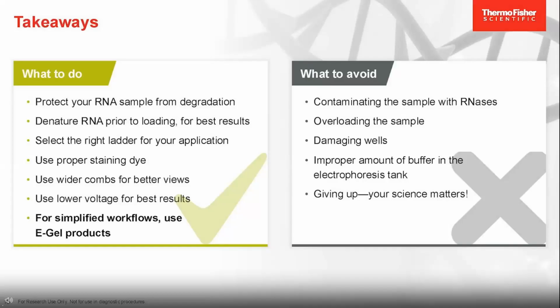Some things that you would like to avoid: contaminating your RNA samples with RNases, which will just degrade your samples, overloading the sample, and damaging the wells when you are loading. This applies to your homemade agarose gel as well as the eGel EX gels. Also avoid an improper amount of buffer in the electrophoresis tank, so just make sure that everything is submerged correctly. And finally, never give up, because your science matters.